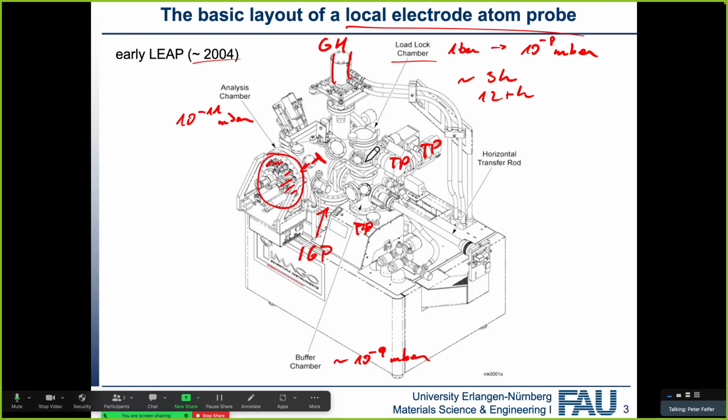And what the vacuum chamber is about, because you see the vacuum chamber is also not like a regular vacuum chamber you know from your SEM or any low vacuum systems. It's an ultra-high vacuum system, meaning everything is completely made from metal, so that we can heat it up to high temperatures, somewhere between 120 and 150 degrees C, so that we get fast desorption of water vapor and we can get a very clean system. We call that baking, and we'll get to that. And lastly, we talk about the detection system, pulsing system, and so on.